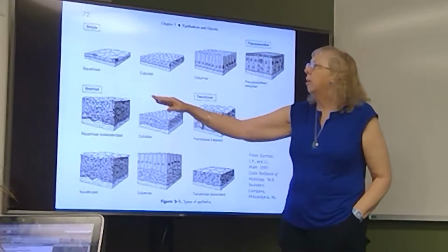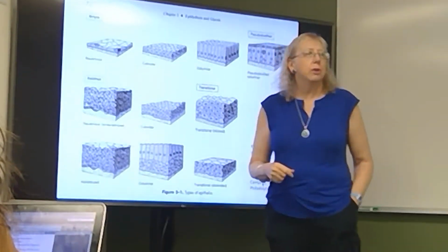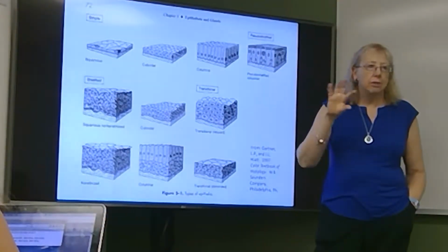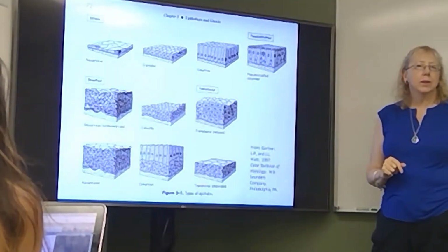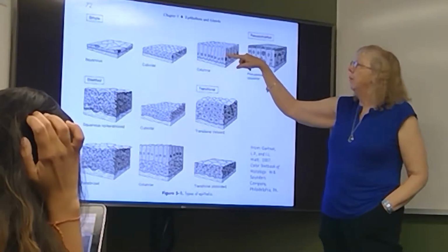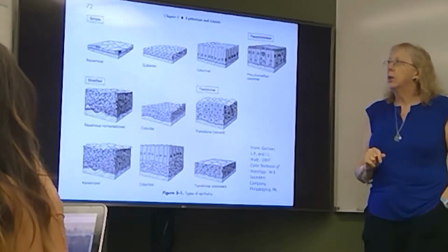By shape, we have squamous, which are flattened, compressed cells. You may see a little bulge where the nucleus is in the cell. You'll see examples of these, particularly in the blood vessel lining. Cuboidal cells have nuclei in the middle of the cells, with kind of uniform cytoplasm covering around them. Columnar cells are taller than they are wide, and their nuclei may be placed along the base of the cells next to the connective tissue, in the middle, or closer to the apical surface. Columnar cells may vary and have cilia or microvilli, as we'll see.